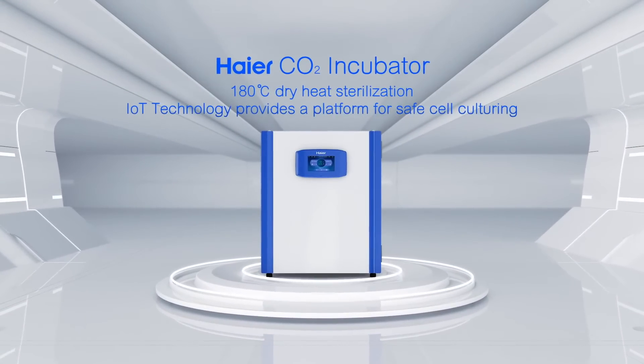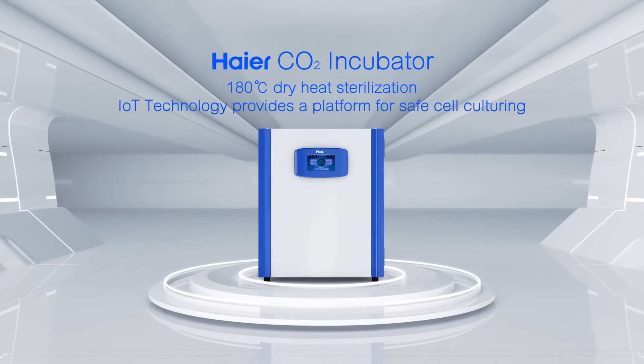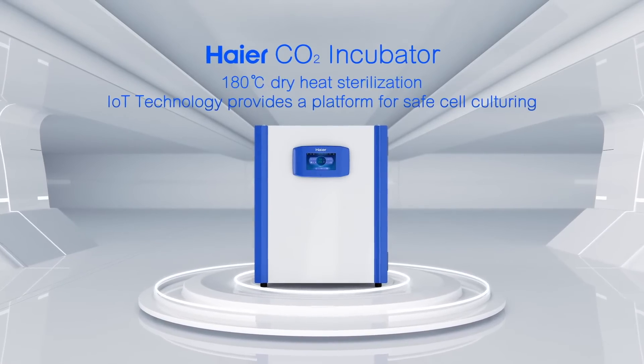180 degree Celsius dry heat sterilization. IoT technology provides a platform for safe cell culturing.